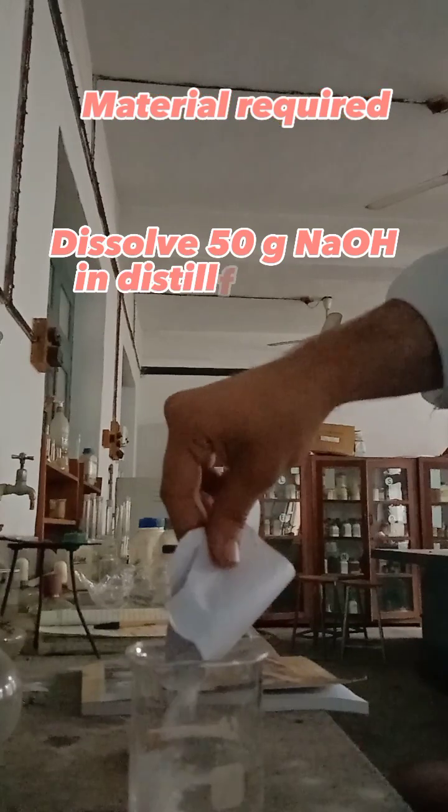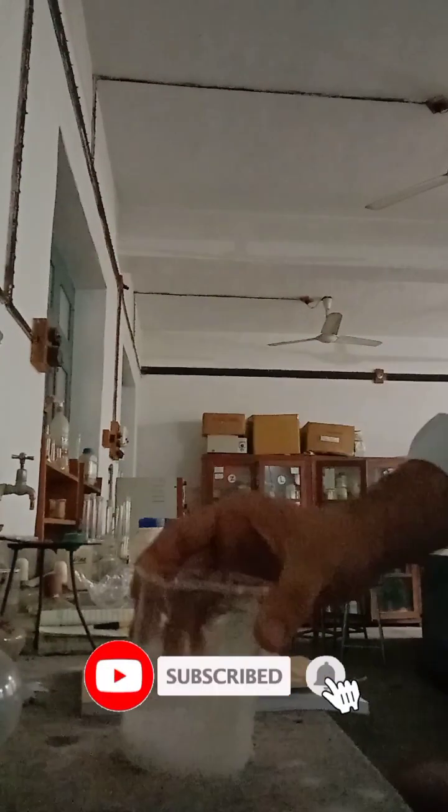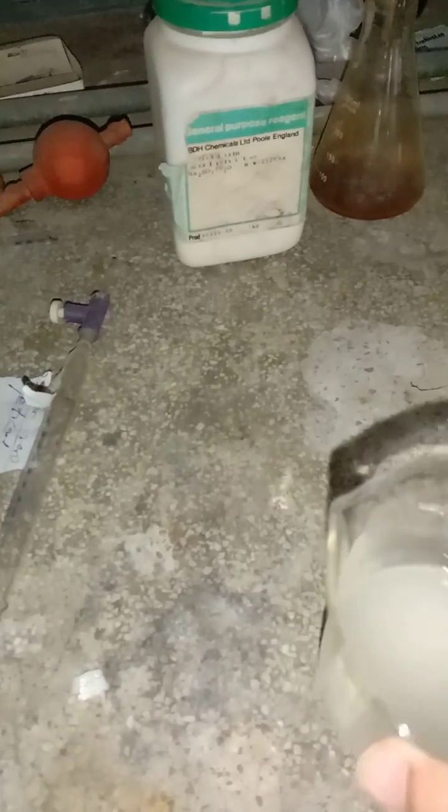The material required: we take 50 grams of sodium hydroxide and dissolve it in distilled water and shake properly. This is the sodium hydroxide solution that we prepared.